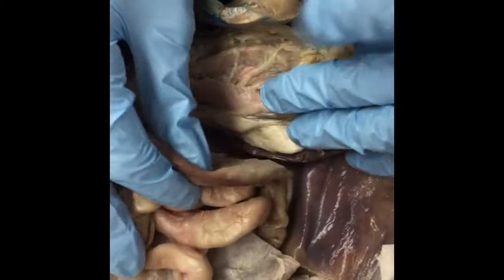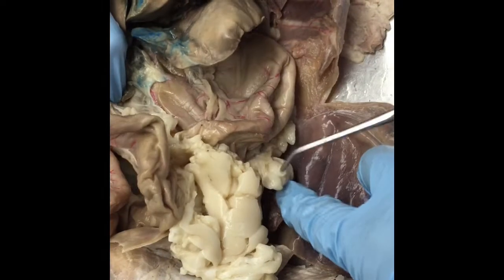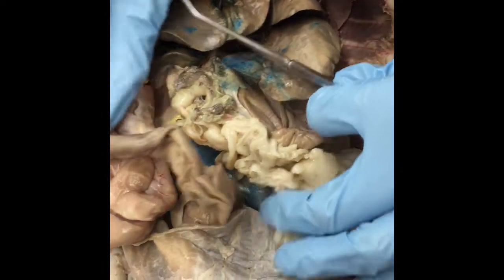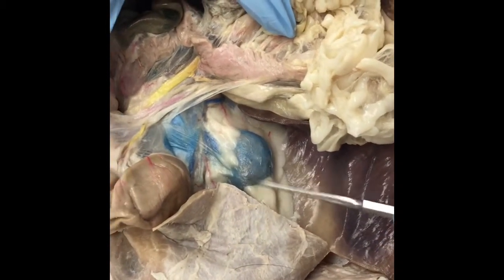You can also reflect it and then look at it and see it better. The spleen is up here, right here. And then if we bring it back again, we can see the left kidney.